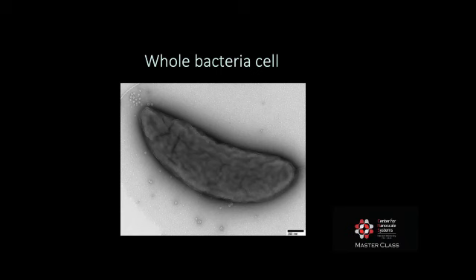We can also look at small whole cells. In this case, we have a whole bacteria cell. What we were looking for here was whether or not the cell is actually expelling these tiny micro vesicles. You can see a flagella on this end of the cell. What we can't know for sure by negative staining is whether these ruffles and convolutions on the surface of the cell are real. So this is one of the downsides of negative staining, because the sample is dried.